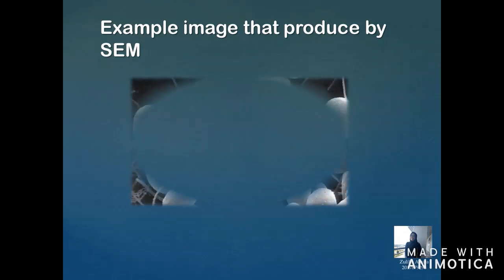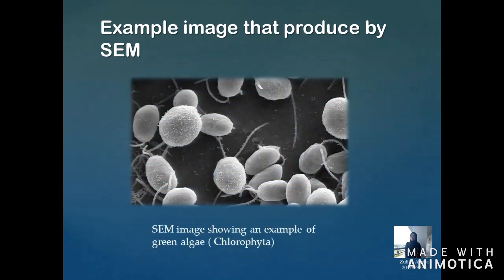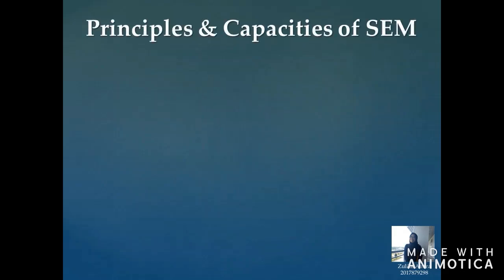This is an example of an image produced by a scanning electron microscope. This image shows an example of green algae. Principle and capabilities of the scanning electron microscope.